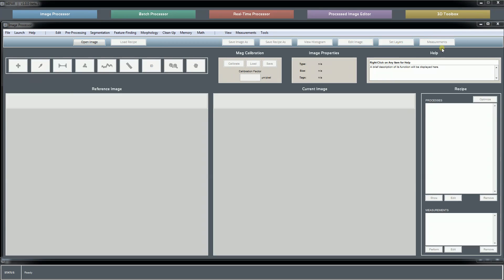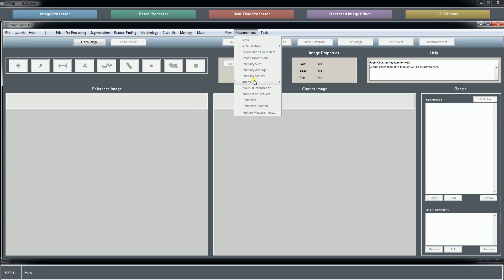This shortcut helps you generate feature-by-feature measurements. If you want to generate global measurements such as area fraction, mean intercept, number of features, perimeter, those are available here. Clicking feature-by-feature measurements will give you the same interface as clicking measurements in the shortcut bar.